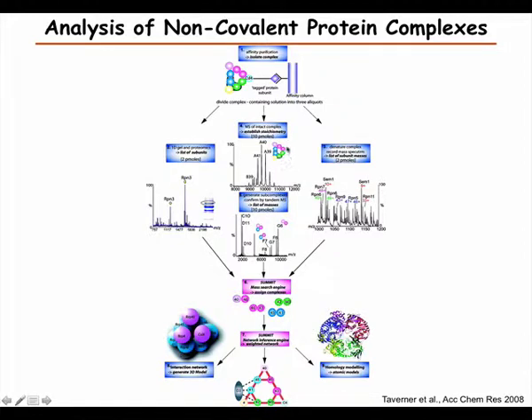And then usually these complexes are very highly charged, but we can measure the mass very accurately, and if we know the component list well, then we can determine the stoichiometry of each of the proteins. But then we can also, in the gas phase, fragment the complex and measure the fragments.